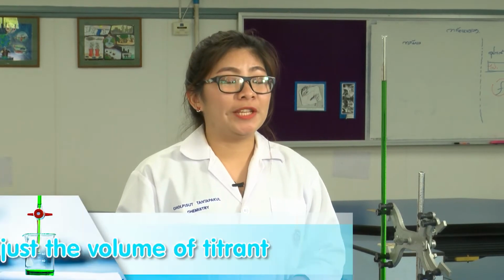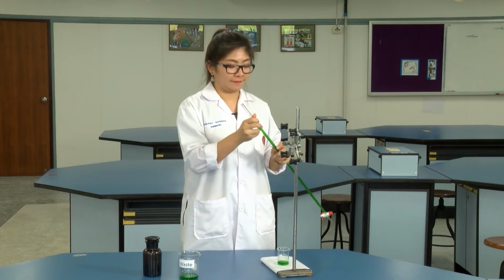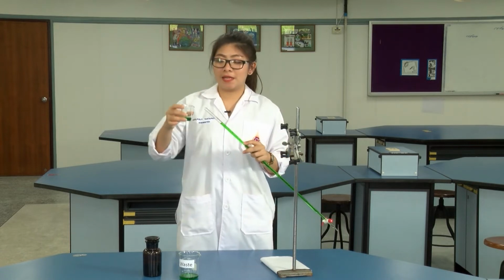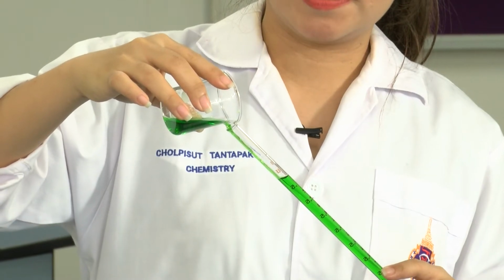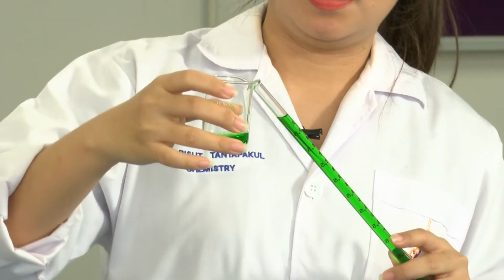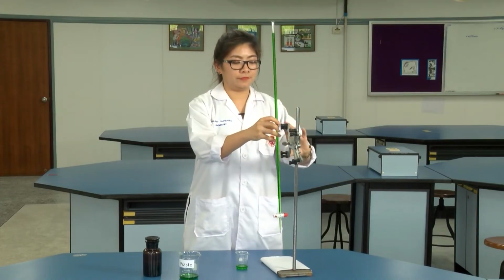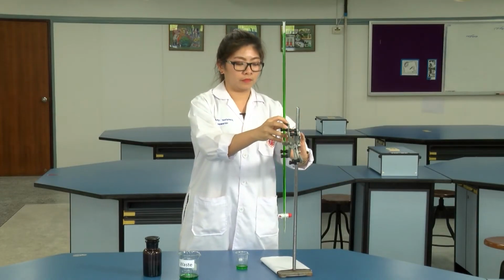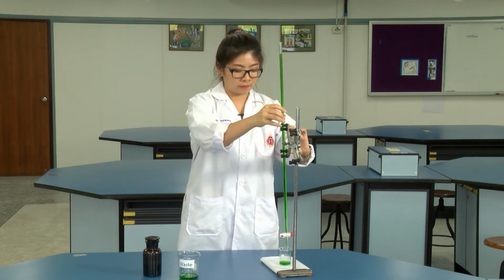For the next step, we need to adjust the volume in the burette. Fill your standard solution. Your standard solution has to be over the zero scale. Adjust the volume in the burette.